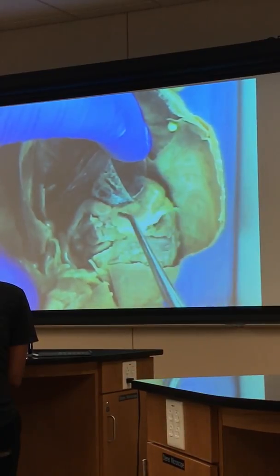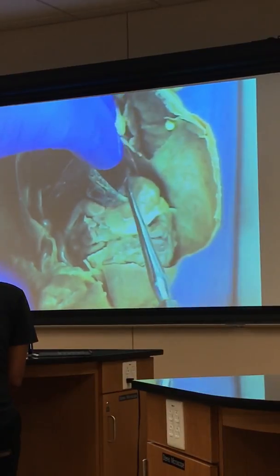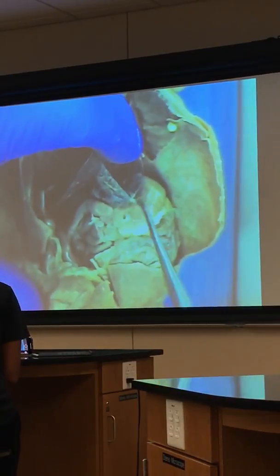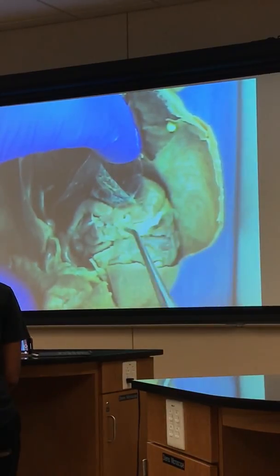So here's the stomach right here. All right. So here's the stomach, and this portion of the stomach, there's a lesser curvature of the stomach. All right, that's the inside tight turn.